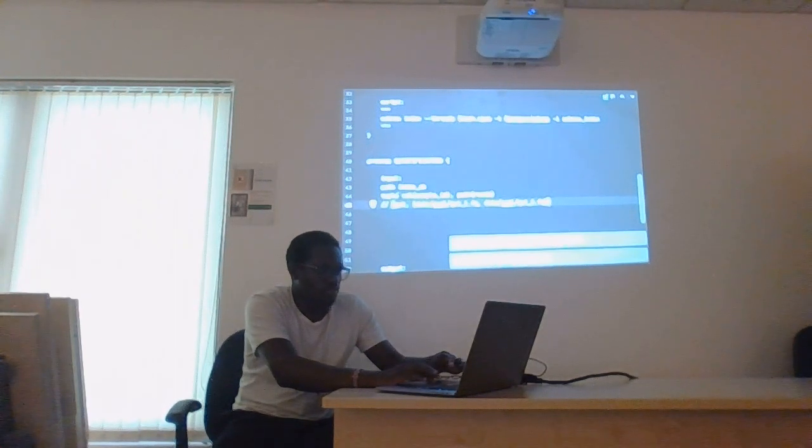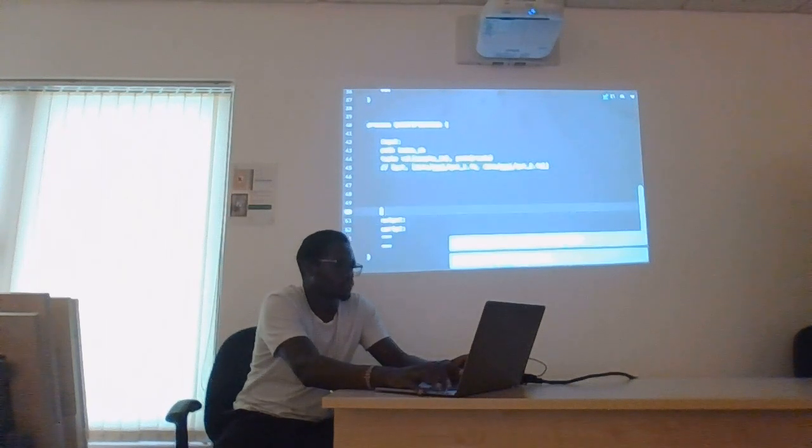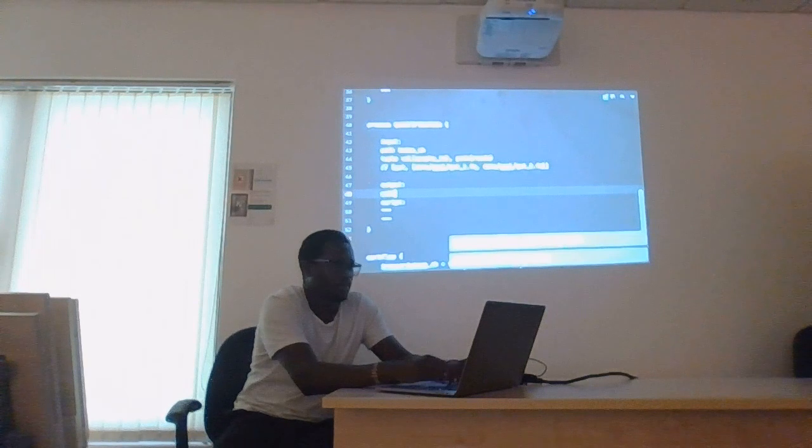So what this process is going to require is the sample ID here, which is represented as GAT. It's a tuple of values. So it's going to take the GAT as a sample ID, and then the reads is going to be the list of reads. Okay. What output are we expecting? A path.